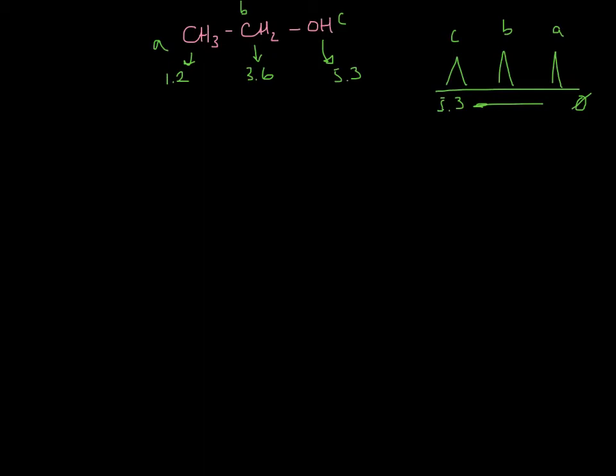Alright, let's do a couple more examples. If you just took the blank alkane of butane, which is CH3, CH2, CH2, CH3, it's not very exciting. There's actually only 2 different amounts of shielding. The ones furthest to the right and furthest to the left look exactly the same. They've got the exact same stuff around them. So both of these guys show up around 0.9 ppm.